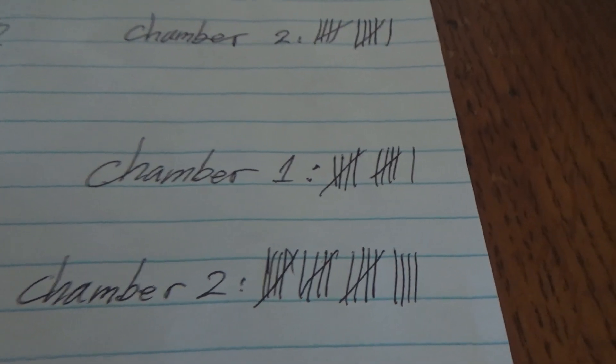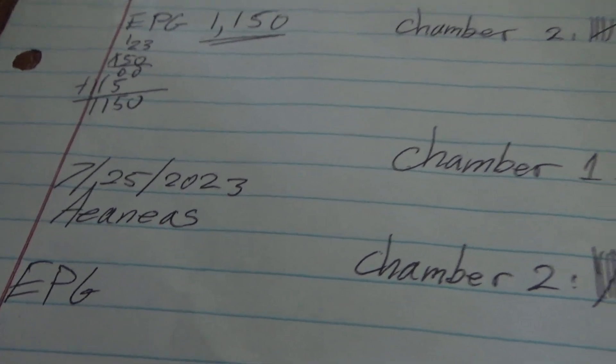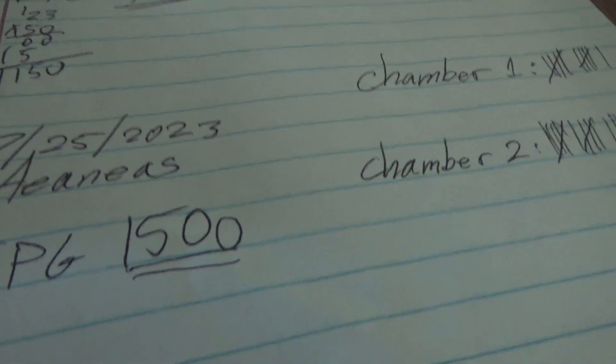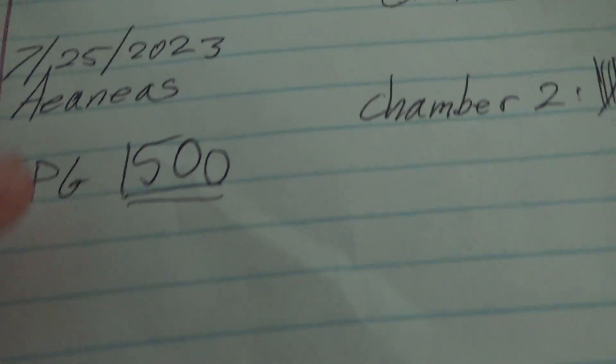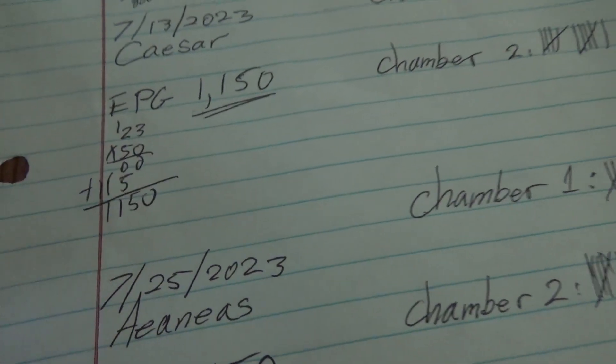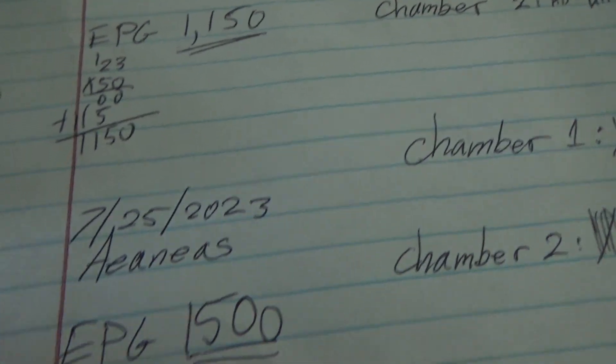So I've written down 1,500 eggs per gram — that's kind of average for me; I'd like to keep them less than that. You can see I did one at 1,150 and one at 800. 800 is a good worm count, not too bad. Both of these guys could be dewormed and that would be fine. But of course you're also going to have to check their FAMACHA score to see if they even need it, because if they have a worm load like this and still have a really good FAMACHA score, they don't need to be dewormed because they're handling that worm load really well. So now that we've determined that Aeneas could be dewormed, I'll show you the dewormer I use.